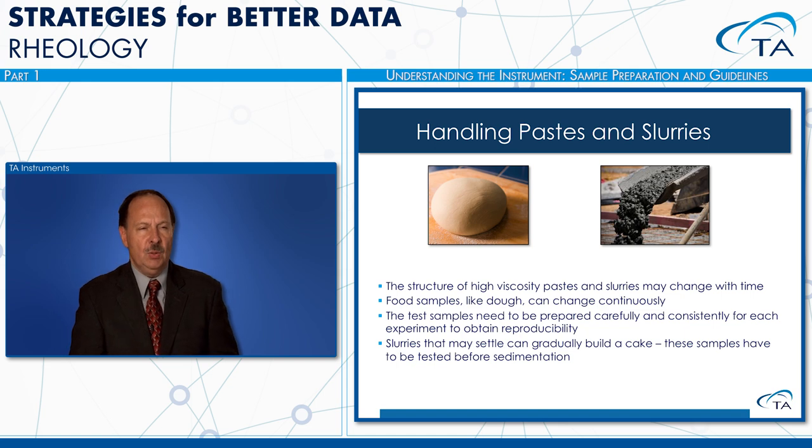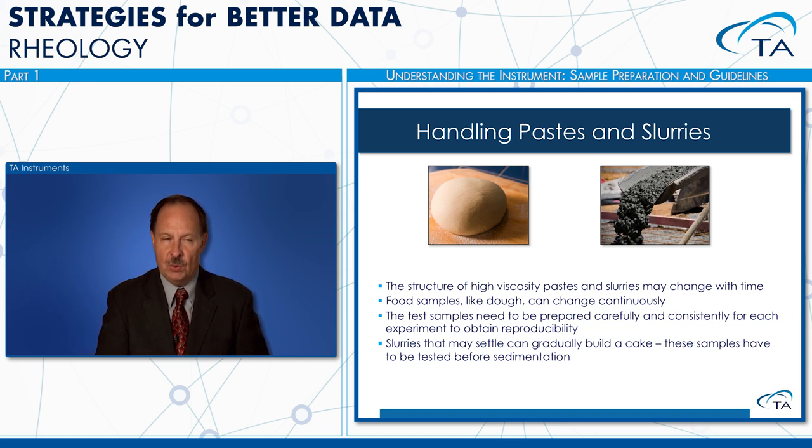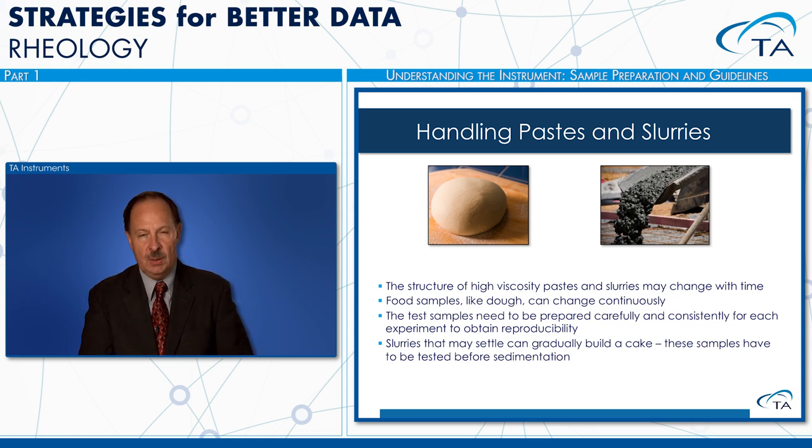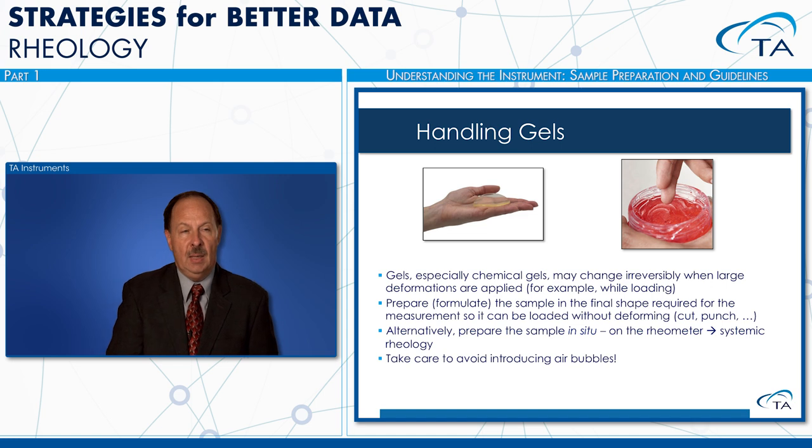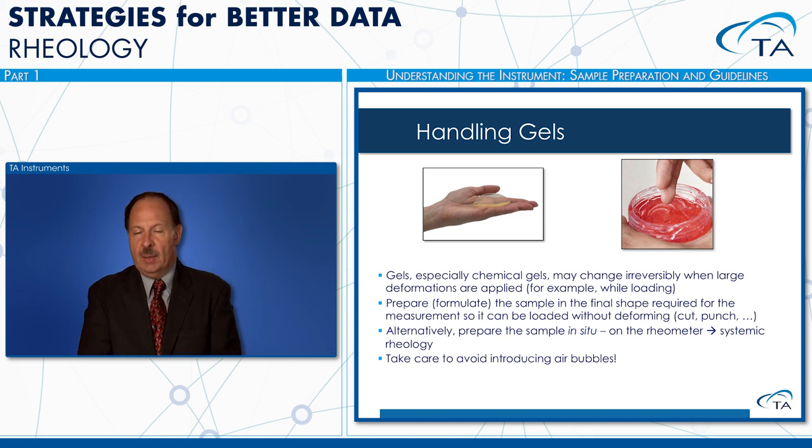And things like slurries, if they settle and then they form a cake, you don't want those to form a real solid cake and potentially ruin your rotor and cup. And gels can also be very sensitive.